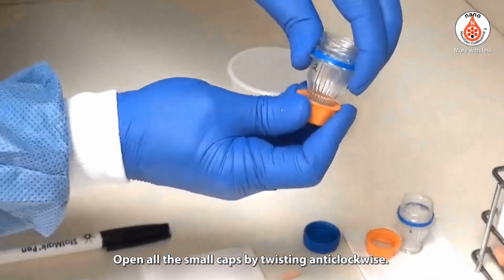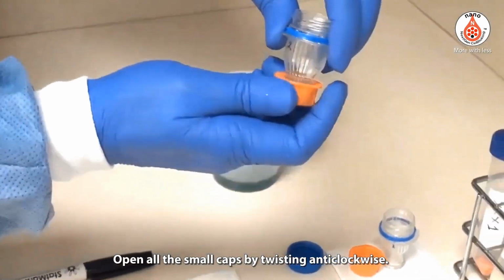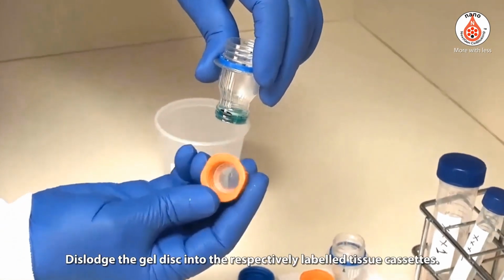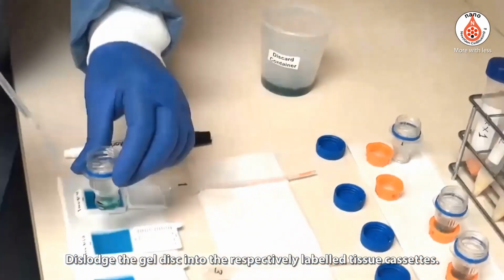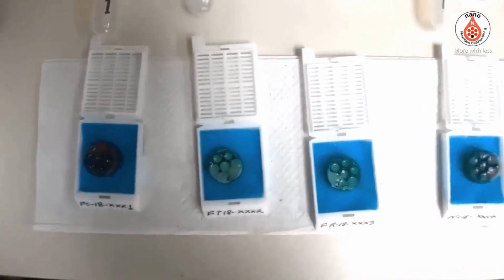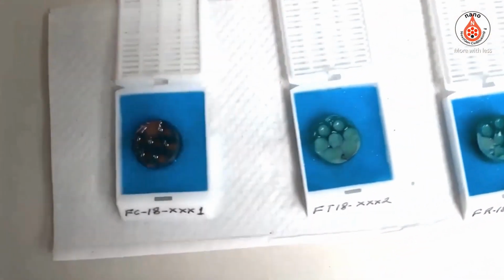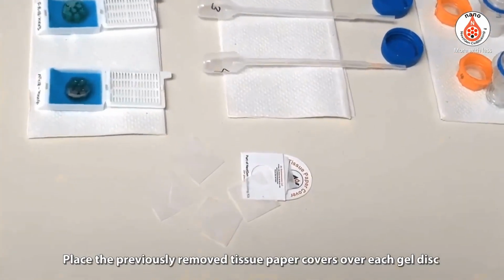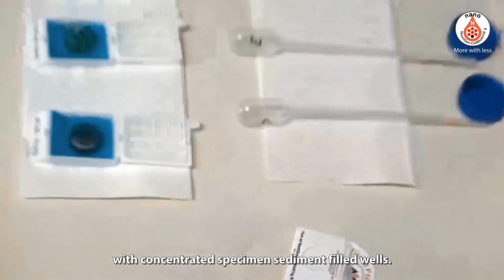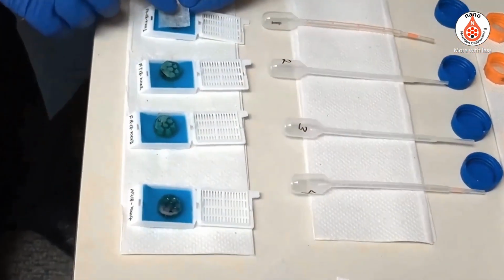Open all the small caps by twisting anti-clockwise. The washers usually come out with the small caps. Dislodge the gel disc into the respectively labeled tissue cassettes. Place the previously removed tissue paper covers over each gel disc, with the concentrated specimen sediment-filled wells.